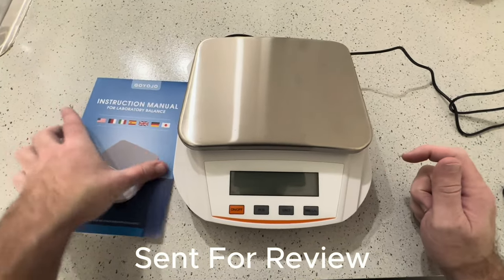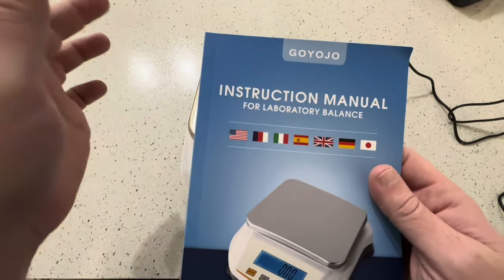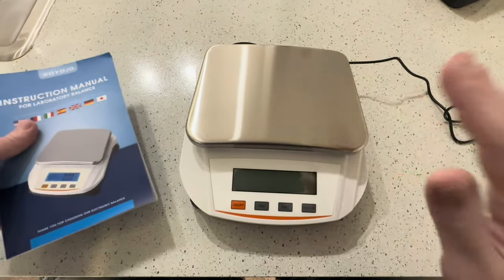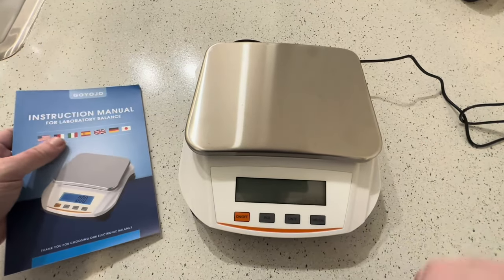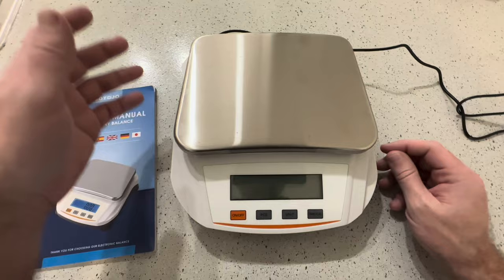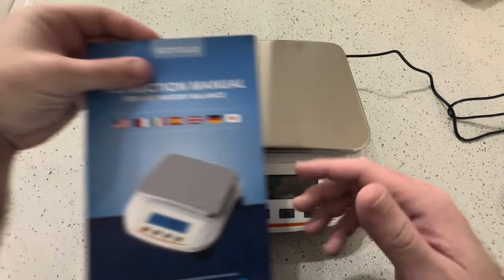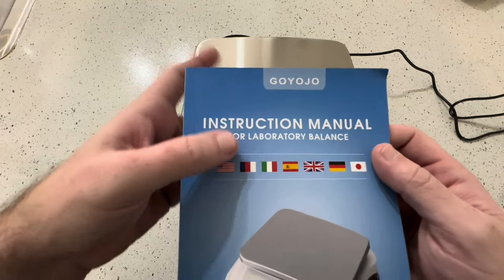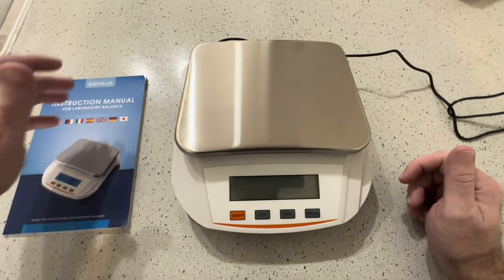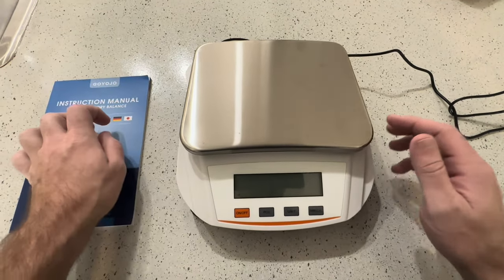We're going to be making a video about this GOYOJO — this is a laboratory balance. This was sent to me for testing and review. You could buy this for a lot of different reasons. We can see here that this is a laboratory balance, but a lot of people would probably also use this in their kitchen to weigh their food and all that good stuff.